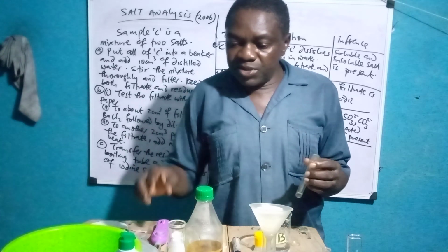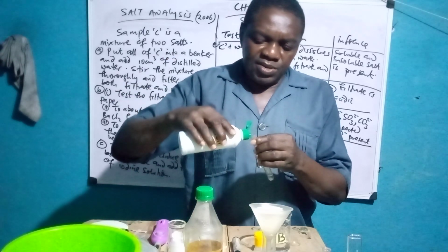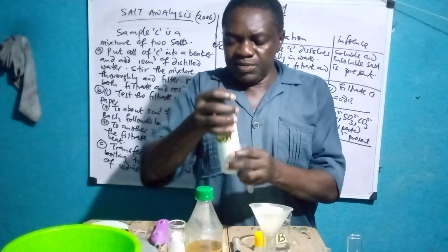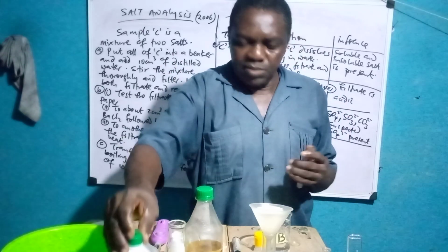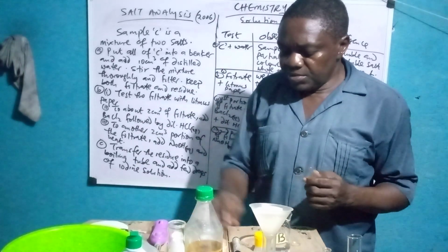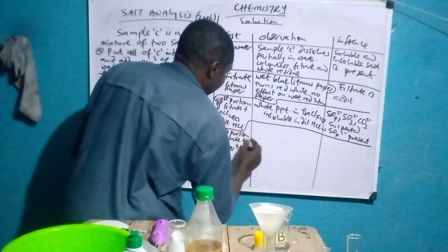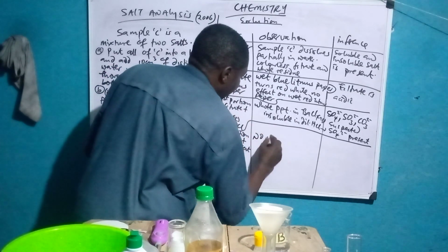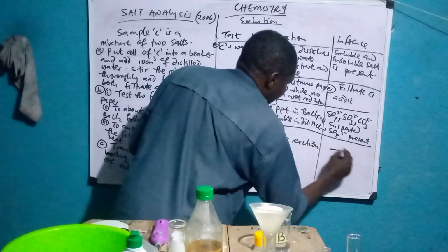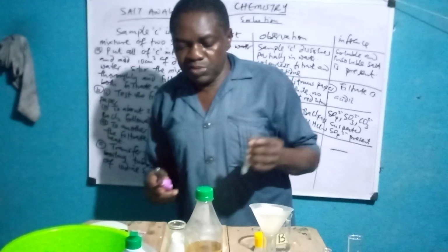They say add sodium hydroxide. So this is sodium hydroxide and heat. We already added sodium hydroxide. Here you have no visible reaction. The sodium hydroxide, you say no visible reaction. Here you put dash. They say it should heat. So we'll just heat like this.